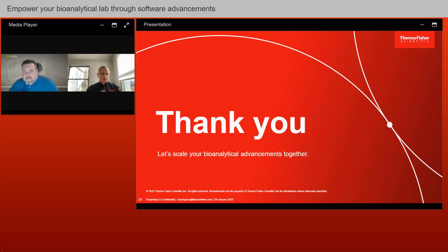The initial process we went through was we built out the operational qualification tests in a tool that actually automates the mouse clicks and the keyboard presses, and then takes screenshots of everything that it does, so you can see the steps it's carried out. It compares those screenshots and the values that come out of the system to the nominal ones, the ones that we're aiming for, and then provides a report that you can query instead of a paper report that you can't search. This is a report that you can search through, find any deviations, quickly correct them, and move on.